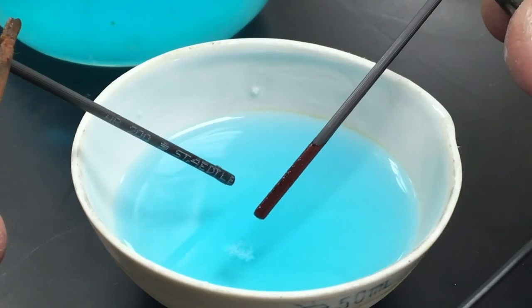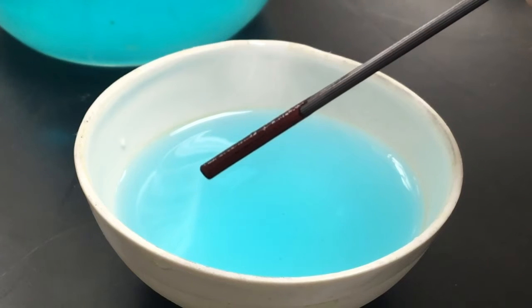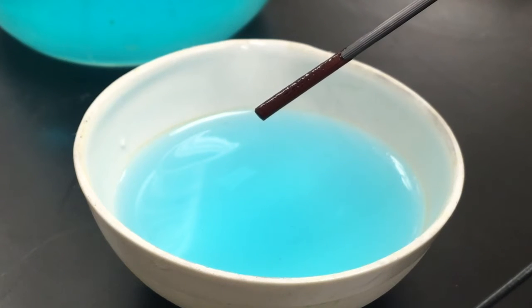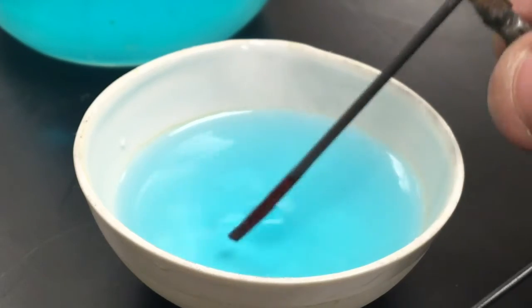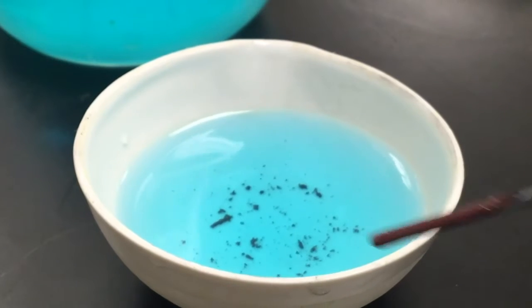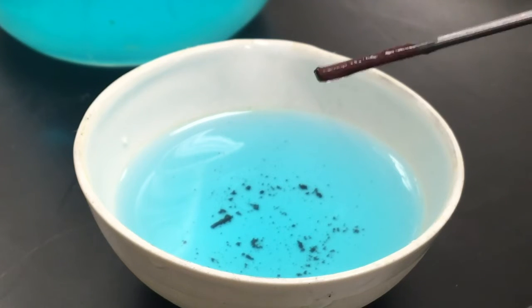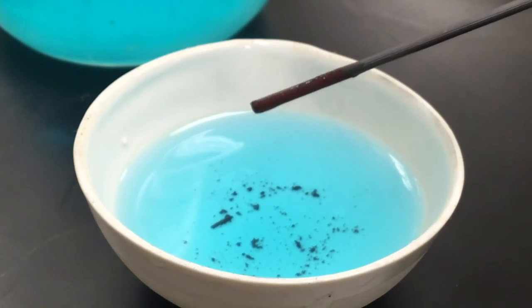Now this will keep reacting, but I wanted to pull these out and give you a little bit of a closer look at this electrode. In the copper chloride, it looks a little different than it does out of it. And that stuff's not attached. If we shook this, it'll fall right back off. I'll have that original graphite electrode back. Right now it's just kind of covered in some stuff that came out of this copper chloride solution.